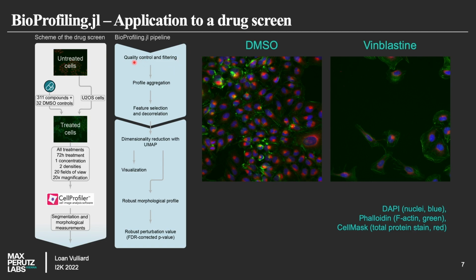After removing obvious imaging artifacts, we aggregated our measurements per image, removed redundant features, transformed our data, and then we were ready to visualize it.